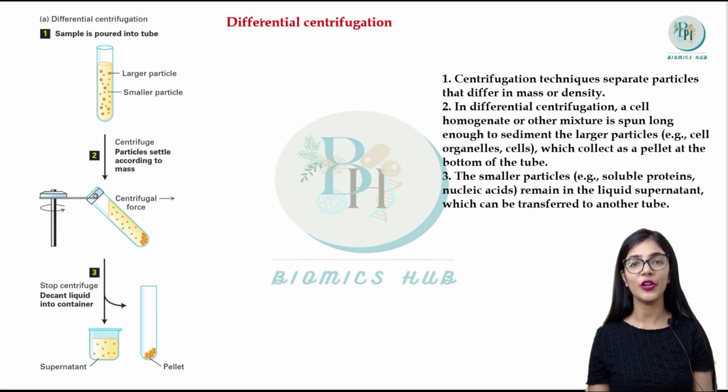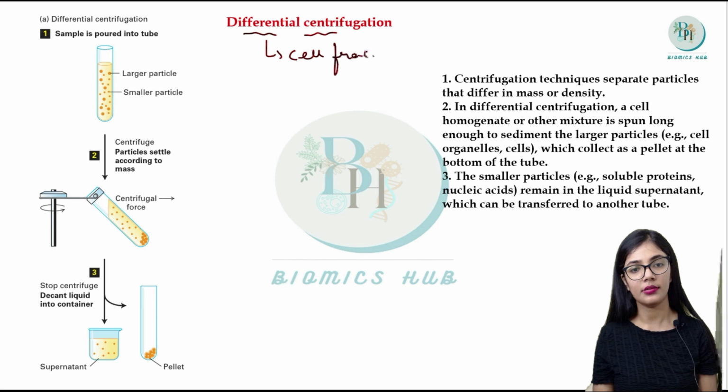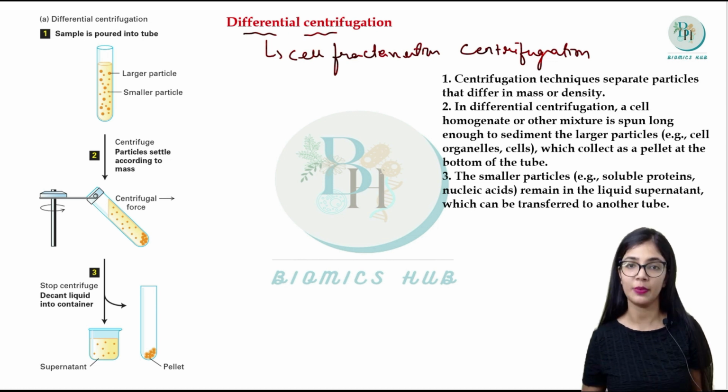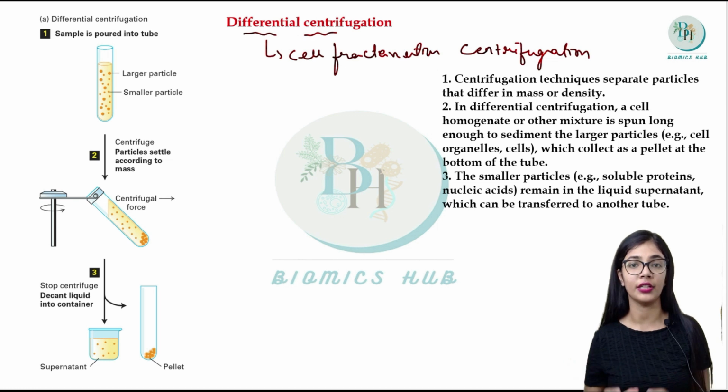Today in this video, we are going to discuss another topic, that is differential centrifugation. We can also call it cell fractionation centrifugation. It is known as cell fractionation centrifugation because in the cell we have various types of cell organelles present. By using this type of technique, we can differentiate or separate the cell organelles.